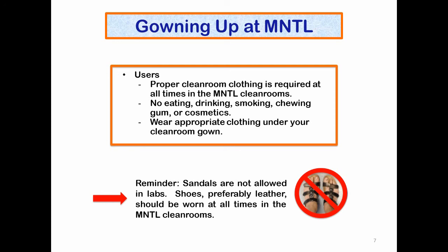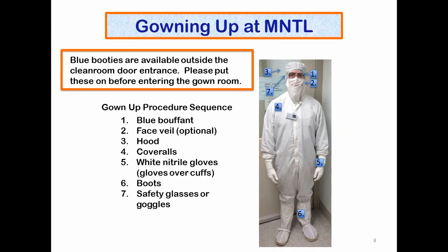And you are required to wear appropriate clothing underneath your cleanroom gown. We do not recommend you wearing shorts or inappropriate shoes. Sandals are not allowed in the lab. Shoes should be leather and not canvas, as canvas would absorb any chemical spills if you spill them on your feet. And this should be worn at all times in the MNTL cleanroom.